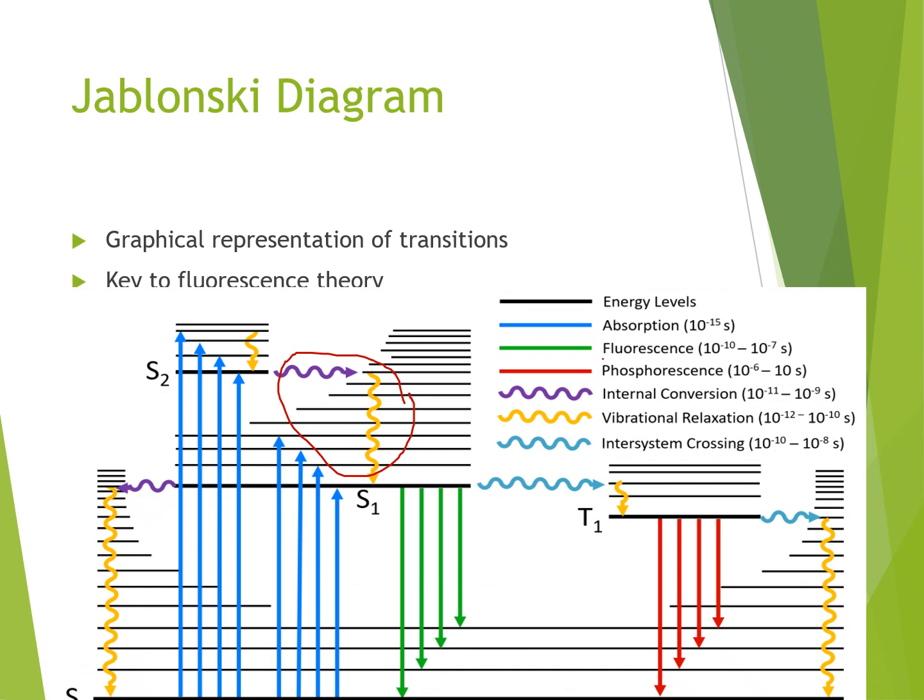It takes 10 raised to minus 10 to 10 raised to minus 7 seconds, and it is a very immediate process. As we can see, the energy is absorbed from here and the molecule is excited to a higher energy level, so more energy is absorbed.